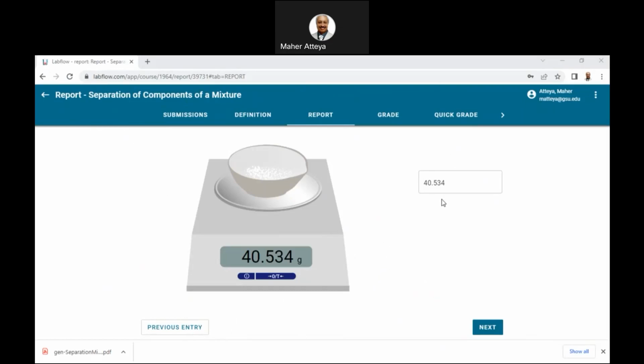It looks like for some reason it's acting up on me. So I will go and close it. I will close this one as well. Now I'll close this one as well. I'll open my lab. See where we're at here.